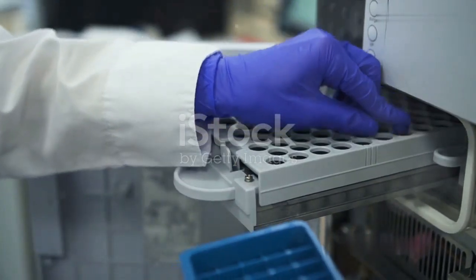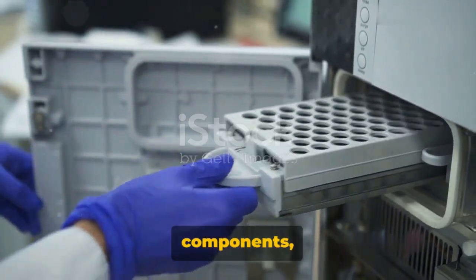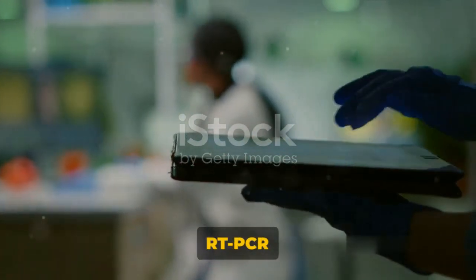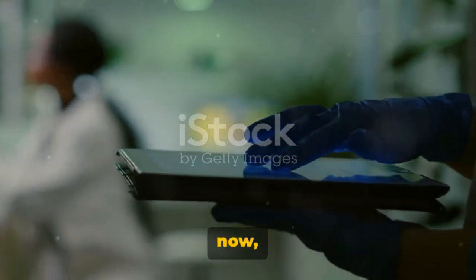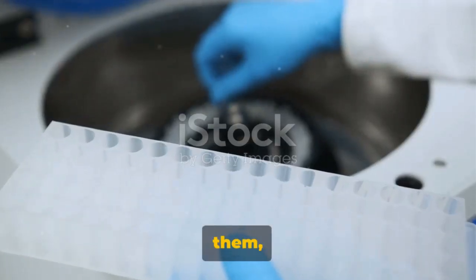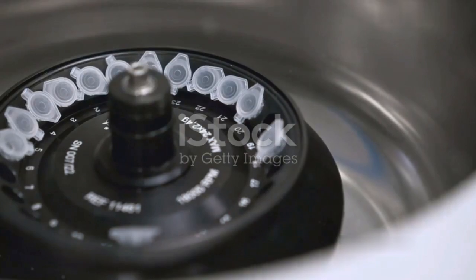It's important to note that while these enzymes are crucial, they don't work alone. They rely on an entire team of components, including primers, deoxynucleotide triphosphates, and PCR buffers, to successfully carry out the RT-PCR process. But we'll delve into these other players in the upcoming scenes. For now, let's appreciate the hard work of our reverse transcriptase and DNA polymerase enzymes. Without them, the magic of RT-PCR simply wouldn't be possible. These enzymes are the workhorses of RT-PCR.